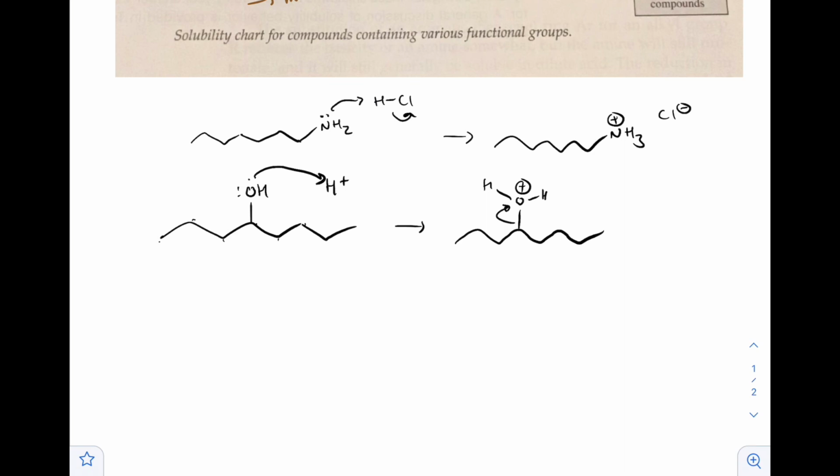So first of all, that's a cation, right? So that's already going to be soluble. But then that can even leave and then you can form an actual cation. And then HSO4 minus is going to be floating around. So essentially, you create something that's charged by the addition of that sulfuric acid, and therefore you are going to create something that is soluble in that sulfuric acid. Okay, because remember, this is concentrated sulfuric acid, so there's sulfuric acid all over the place, right?